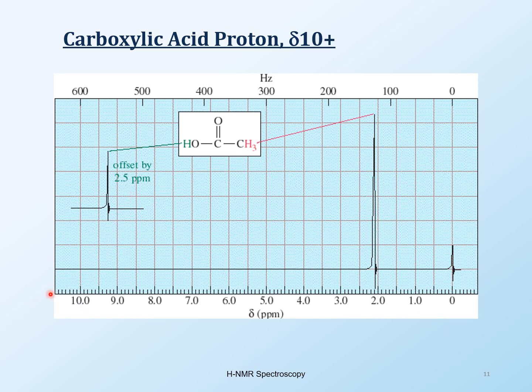So 12.5 ppm. It's a very common thing to do in NMR to cut off a peak and just paste it in the middle here, so you don't have to draw all of it, because there's no signal here, so why print out the whole thing when you don't need it? That's how a carboxylic acid appears, just to show you the downfields.